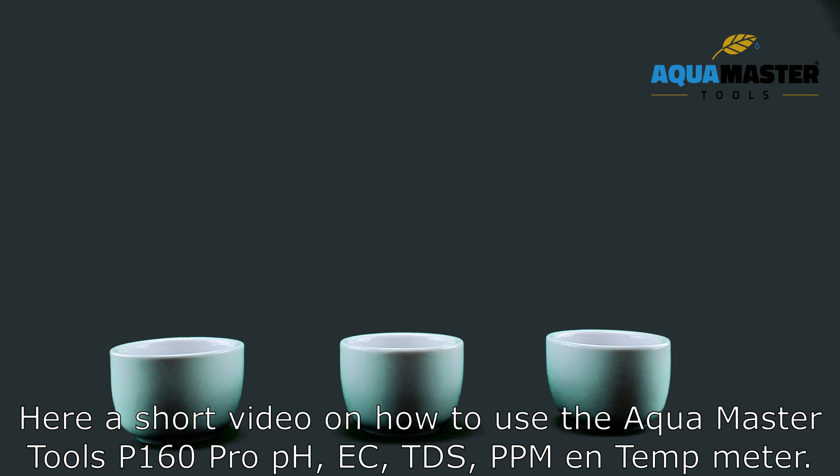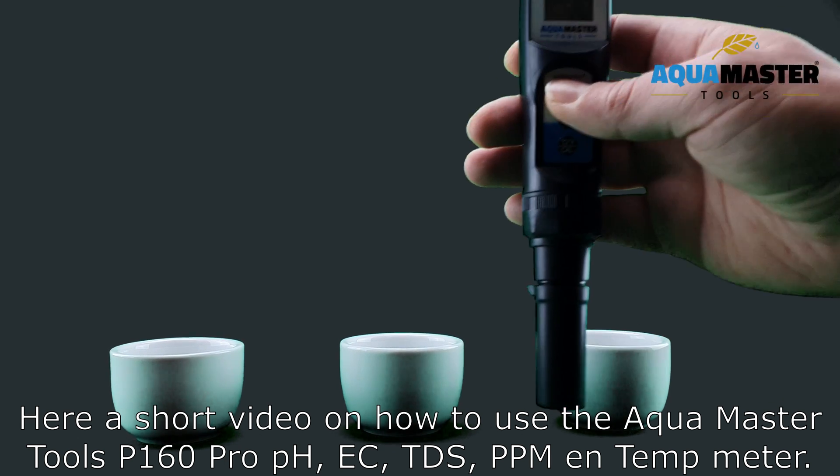Here is a short video on how to use the Aquamaster Tools P160 Pro PH, EC, TDS, PPM, and temp meter.